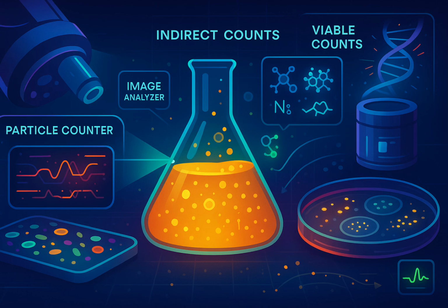Right. You combine that with something like propidium iodide, PI. PI is red, and it can only get into cells with damaged membranes, dead or dying cells, where it stains the DNA. So you see green viable cells and red dead cells. Green means go, red means stop.